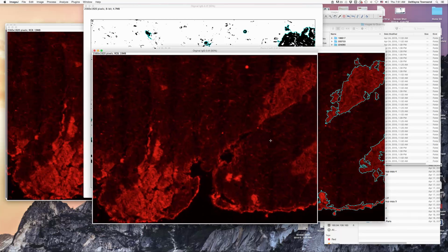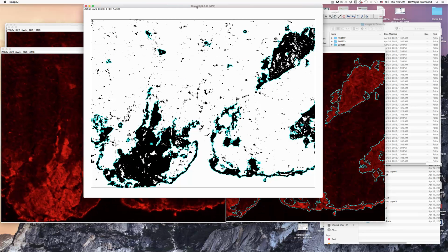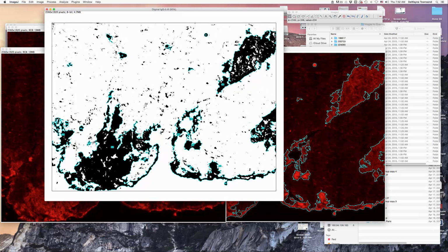Let's start on this far edge over here and look at this area here. You can see it made some indents into this image that probably shouldn't really be there, right? Because this lesion is probably just one big single lesion. But it's drawn some little areas into that lesion that it thinks are different based on the thresholding. So we need to trick the algorithm into thinking that this is all one big area, because it is. So we go back to our thresholded image here, and we need to trick it into thinking that this area is all one big black blob and that it doesn't have to come through here.